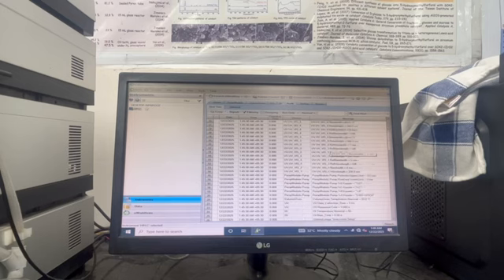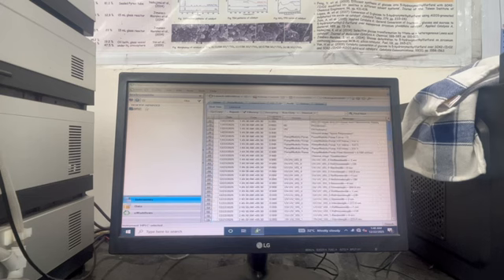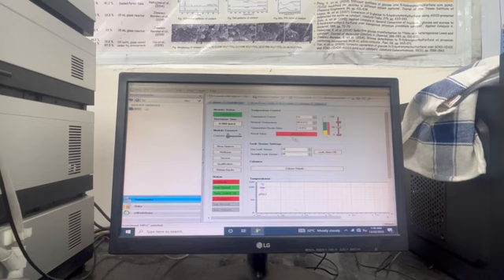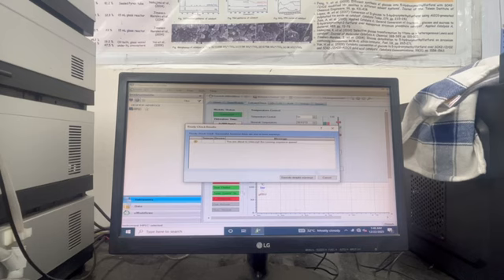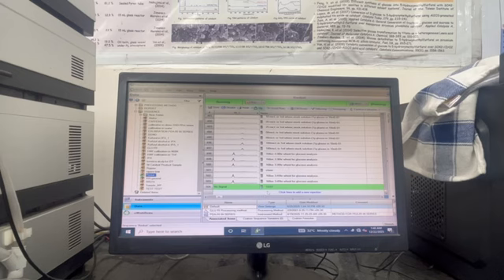Then once that message arrives, I can show you. Anyways, when it's ready, in the audit you will see waiting for injection, something like that will appear. Now maybe it's taking a little time because this is red. Okay, so I can make it 30, because it's on running now I can't change it, so I will stop this one. So immediately I will stop it.